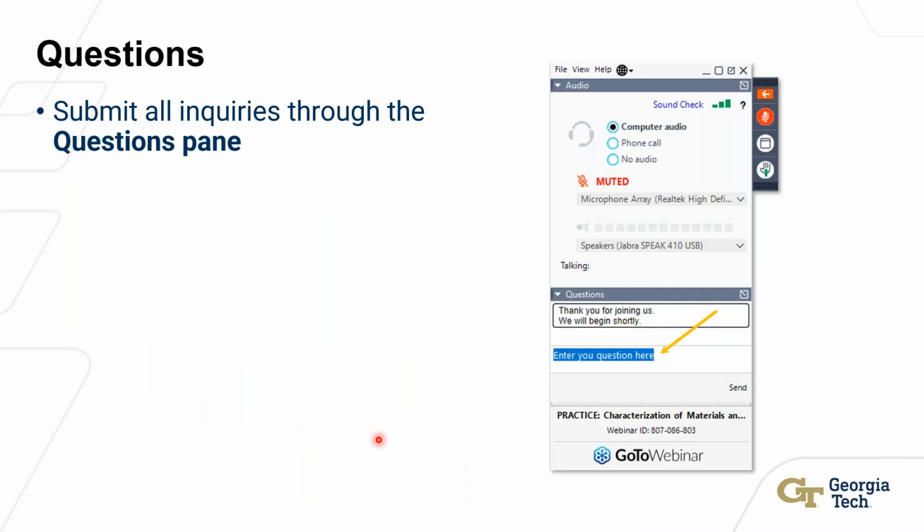Okay, thanks. Another question that has just come in: can you calculate strain for amorphous materials? So there are ways to calculate strain in amorphous materials. I guess there are a few different answers to that. One, we can definitely calculate the total strain for the material, right? These approaches that we're using are very amenable to amorphous materials, and so we can calculate the strain on the full sample.